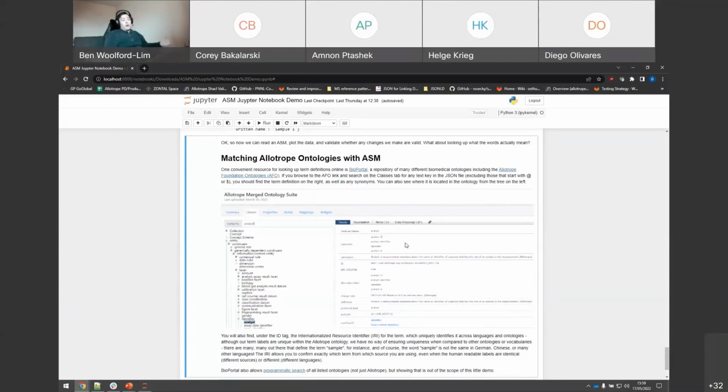If you're not quite sure if the term definition is exactly what you thought it was, or maybe the term wasn't quite how you thought it was, we use preferred labels, but we also have synonyms, alt labels, to say other people call it this. Maybe the term wasn't exactly what you thought it was, but you can see that your term is in the alt label, then it's probably the right term you're after. And we just have a slightly different way of naming it in order to make sure that it's consistent and correct across all of our files and all of our techniques.